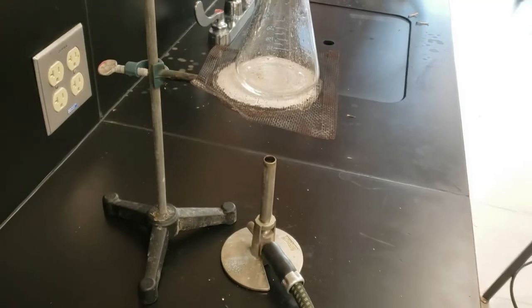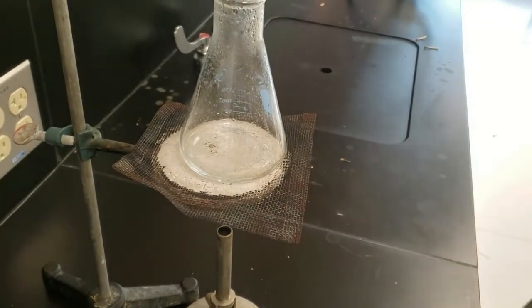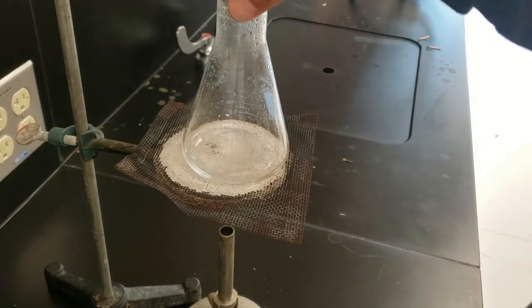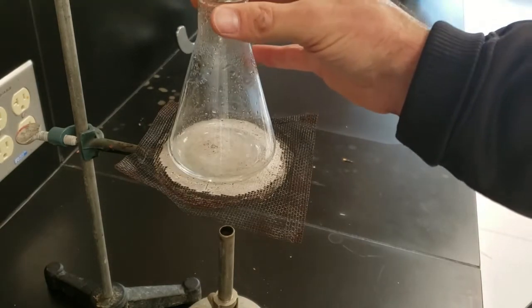All right, so I reached the end of evaporating out most of the liquid, and I poured in the extra 8 milliliters, and now I'm gonna be pouring this into a Petri dish. This thing is super hot right now, so I need to let it cool a bit.